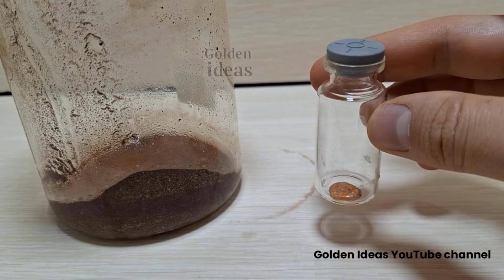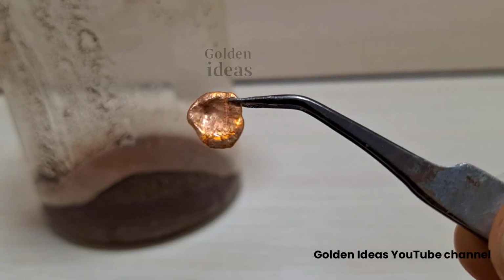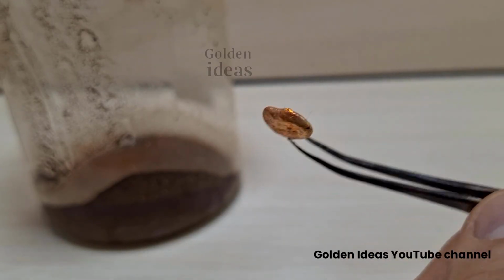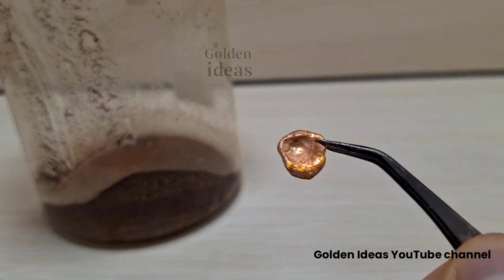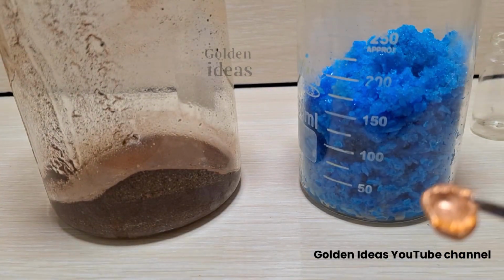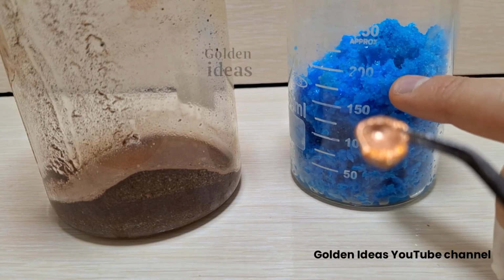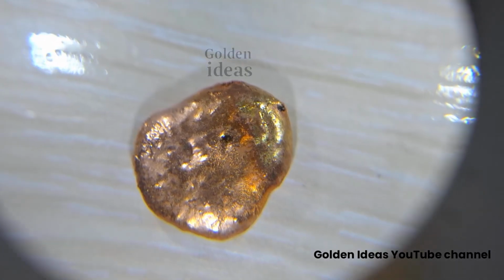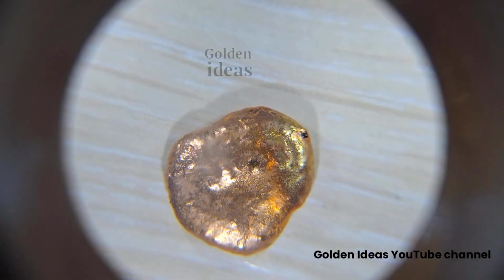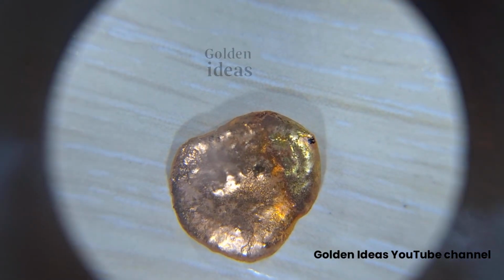This is what I got after melting. Note that I had chosen a larger amount of soil for testing. As you can see, about 2 grams of metal is obtained and it has a lot of impurities. I told you at the beginning that I deliberately chose a low-grade mineral sample to show you the accuracy of this test, but I will definitely show you the test on high-grade soil as well so that you can be sure that this is a practical and effective method. It is economical, especially since no acid is used.